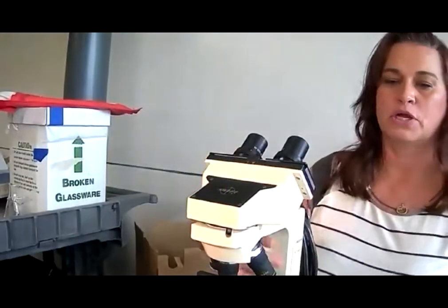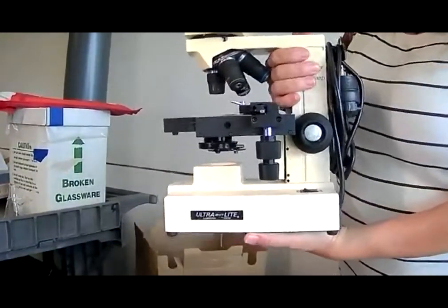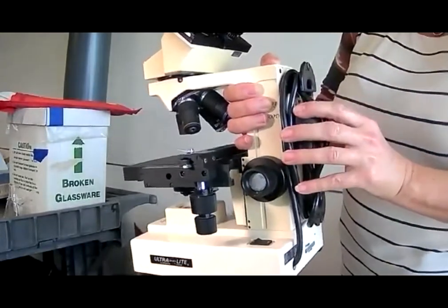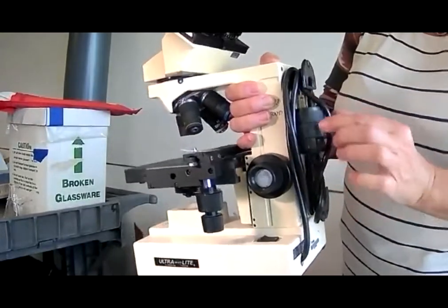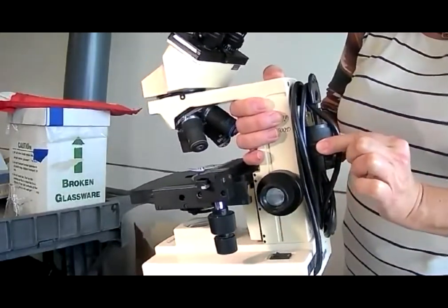So again, let's go back over the steps of how to put up a microscope. You're going to be carrying it with two hands, this hand on the arm, this hand on the base. You're going to make sure that the cord right here is fully wrapped. You're going to pull not by the cord, but by the plug when you're unplugging it.